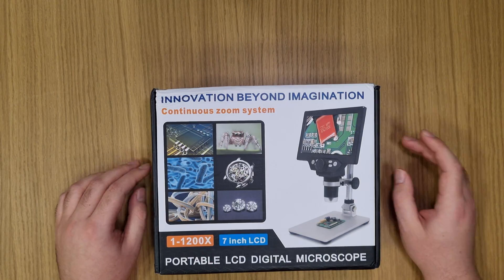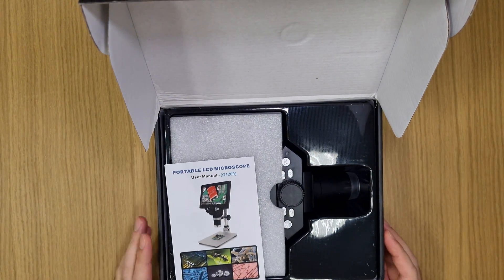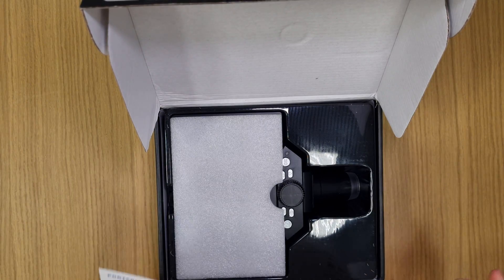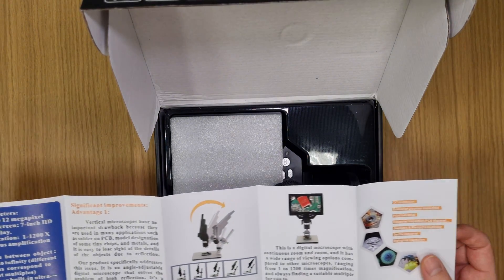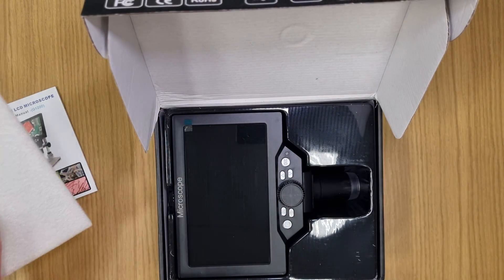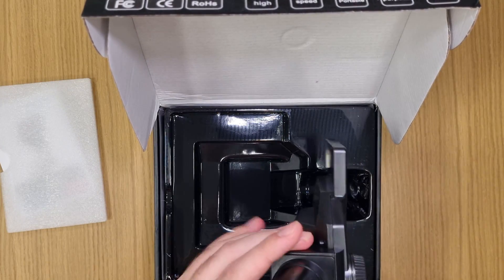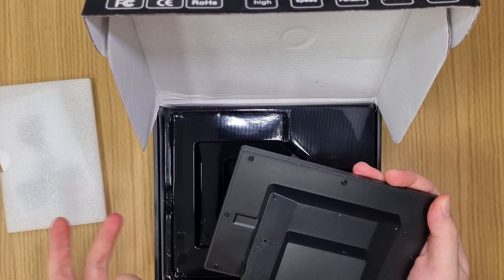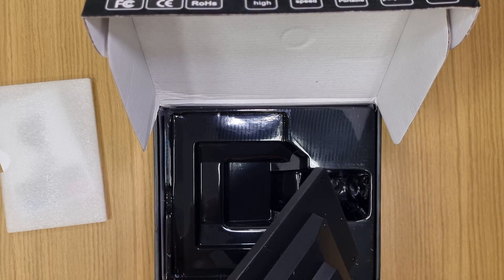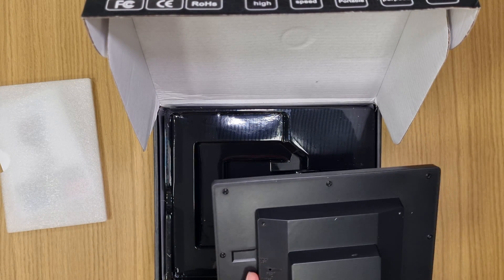Let's get started with the unboxing. In the box we've got a cheap instruction manual — I hope it won't be needed — and the seven-inch screen. It has micro USB, a micro SD card slot, and an LED light. Keep in mind it costs $50.